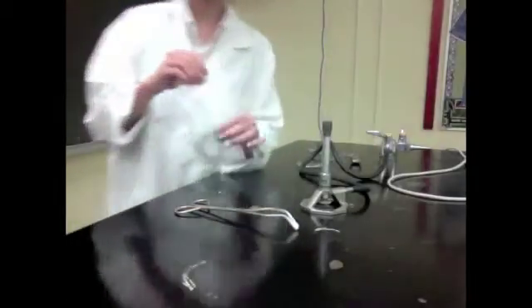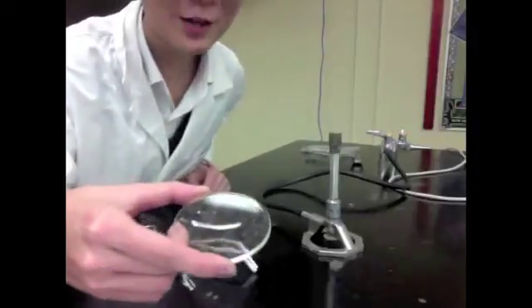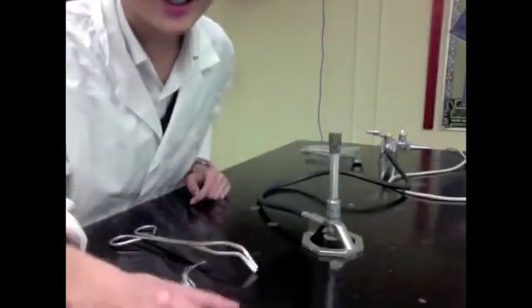We're also going to be using tongs which is to grab the magnesium. Magnesium looks like this and it comes in the shape of a ribbon. So we're just going to be taking a little bit of that. So here's the magnesium ribbon that the teacher will have prepared for you, just a small little piece of magnesium.